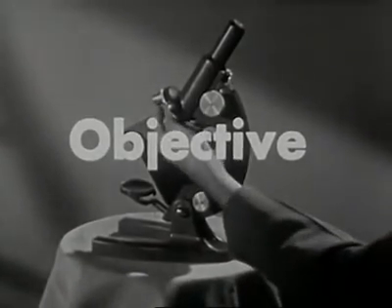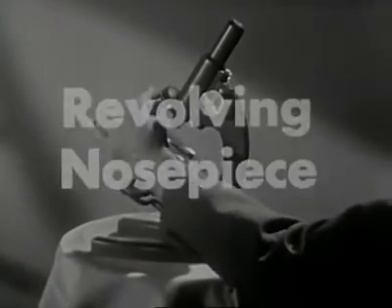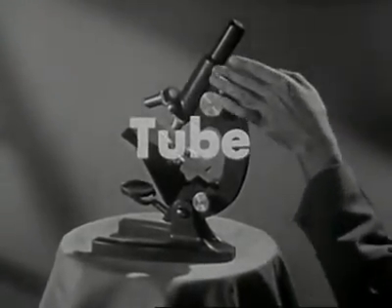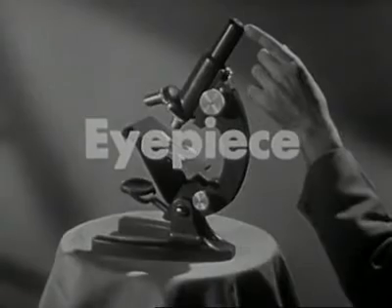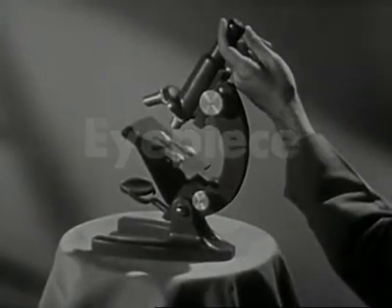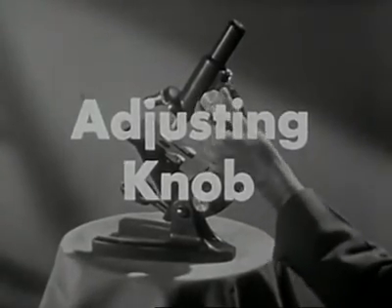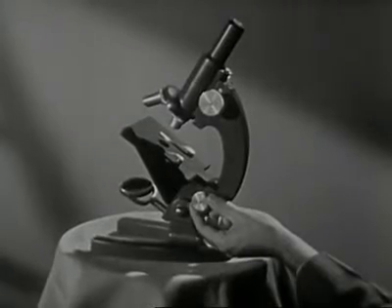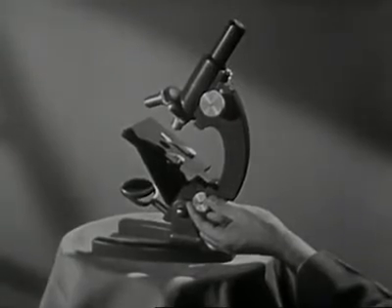The objectives are the lenses which are nearest the specimen, or slide. The objectives are attached to the revolving nose piece, which allows the objectives to be easily changed. The tube is part of the main body of the microscope, so named because of its tubular shape. The eyepiece is the lens located at the top of the tube, nearest the eye. The adjusting knob is used for focusing, and the mirror for reflecting light onto the specimen. An additional focusing knob is found on most modern microscopes. It is used for critical focusing, which we'll learn more about shortly.